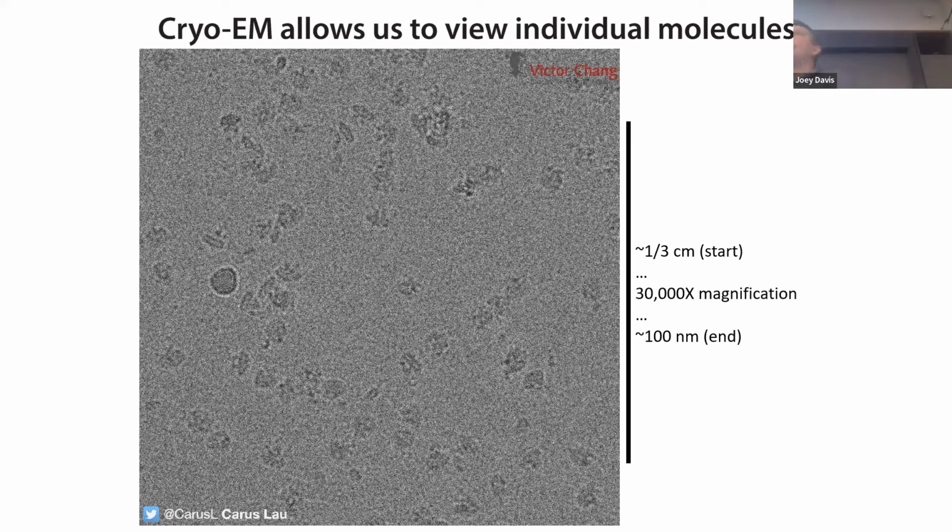And this goes back to this fundamental problem that we can't dose the sample, because if we dose the sample, we'll damage the biomolecule that we're looking at. So we have to apply extremely low dose. And so the shot noise is through the roof. You know, the SNR on these things is like 0.1 or 0.25. It's less than 1. Super, super low, but there is information there.